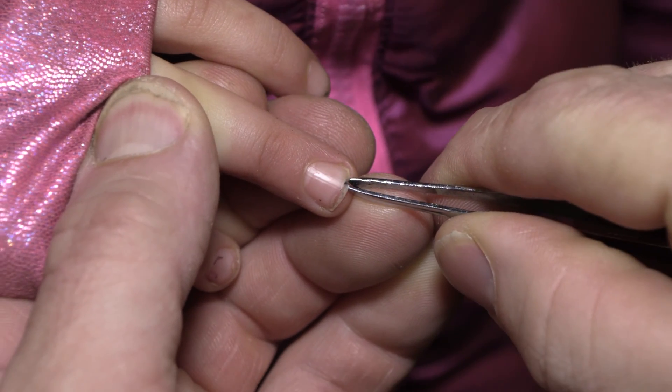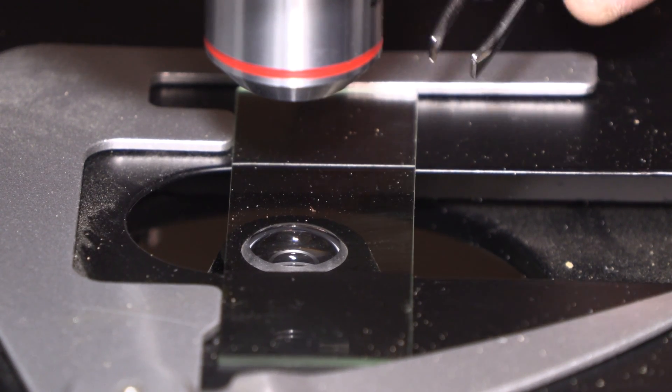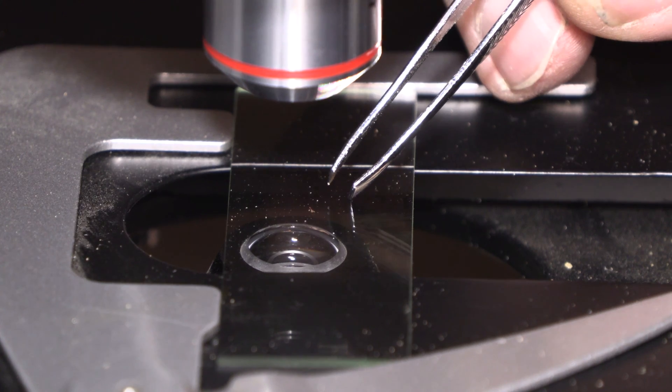The first thing I told her was, 'This is such a small splinter. Do you want to see this under the microscope?' She said yes. When I showed her, she thought it was the coolest thing in the world, so I had the idea to show everybody else what the splinter that I pulled out of her finger looks like under the microscope. A lot of people don't know this, but I have a video microscope set up.